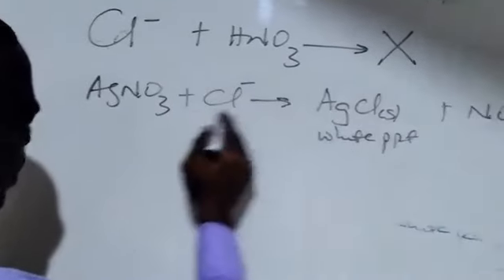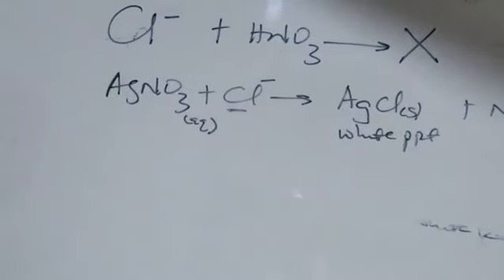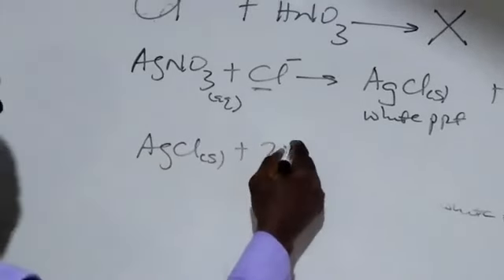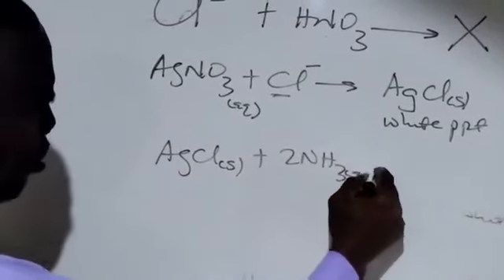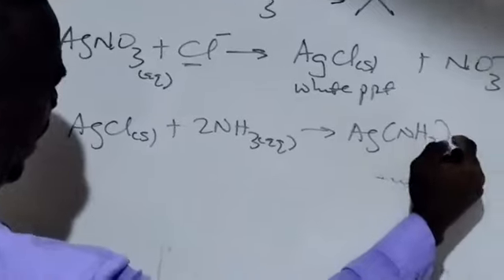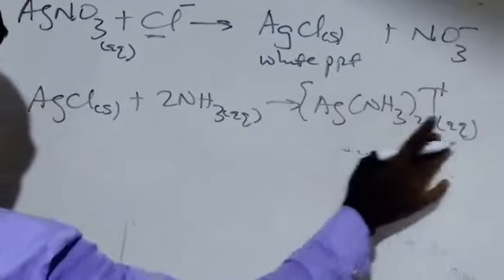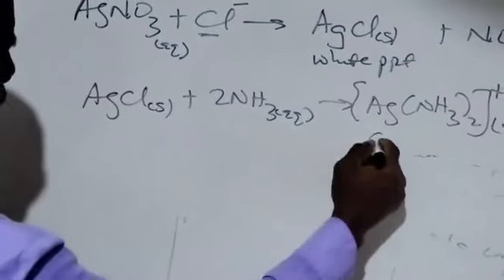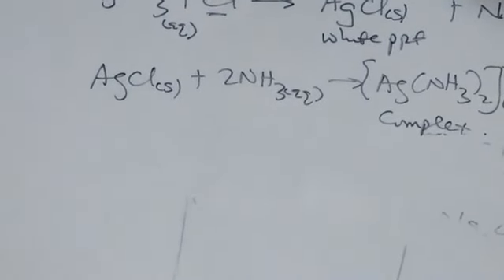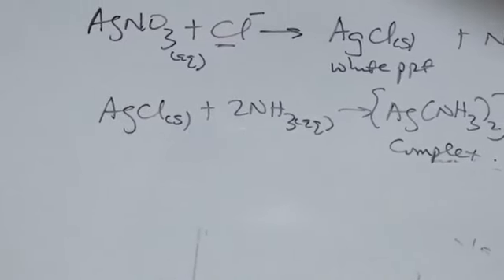So on adding AgNO3 to the chloride, which is present inside the zinc chloride, then on adding ammonia later on to the white precipitate, silver can complex with ammonia to give us the diamminesilver(I) ion. So in excess, the white precipitate dissolved because of the diammine complex formed. So that's what we observe in that question AV.